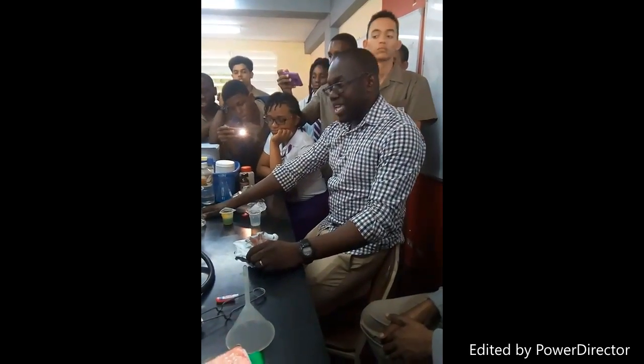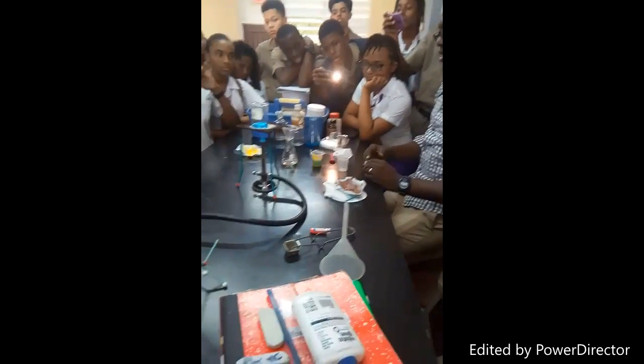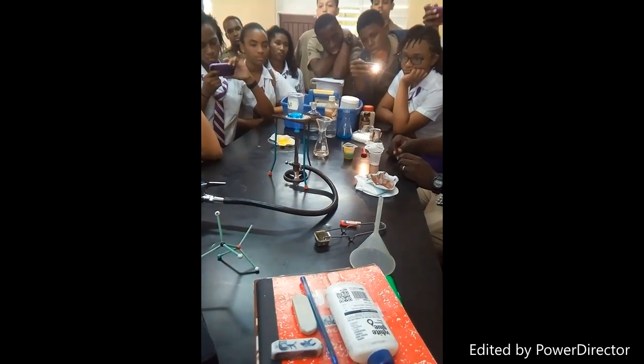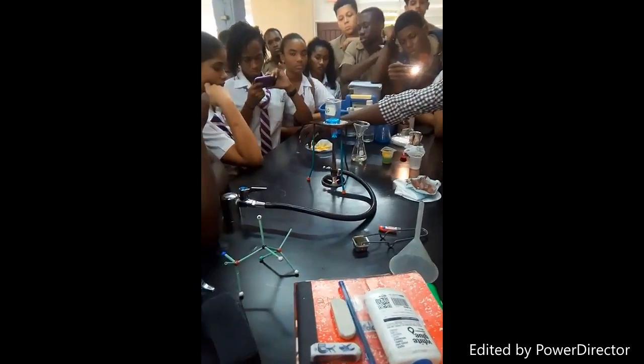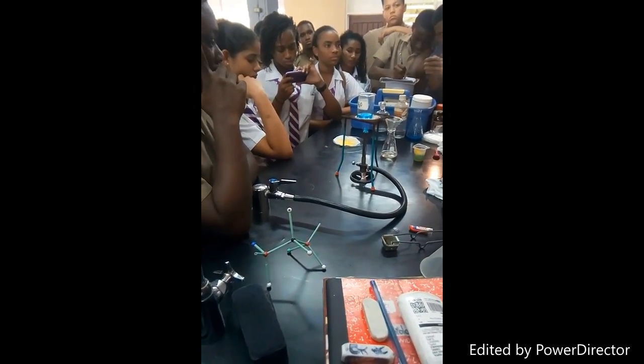Remember what I said. That which I just did is the hardest thing for students to do. All I did was combine my two salts, get my solid, filter, and leave it to dry. Three steps. Make sure you remember that. And if you don't remember it, you're going to lose the 9 marks.